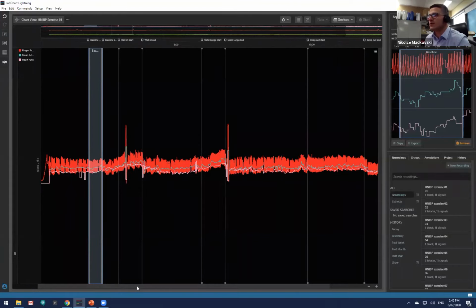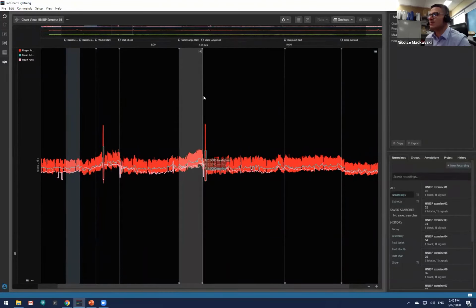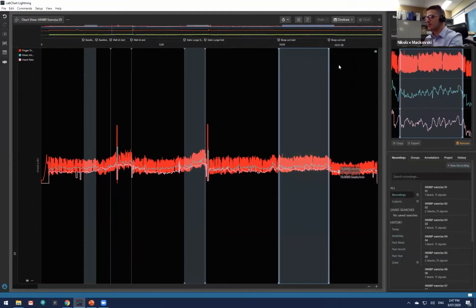So I'm just going to move across here, and let's just choose static here. So we're going to press plus, and we're going to create this as a new region, a new type. So once again, I'm going to go static lunge, just like that, enter. So that's my second region. And I'll do the same thing with this one here. We're just going to left click here and make this a new region type, bicep curl.